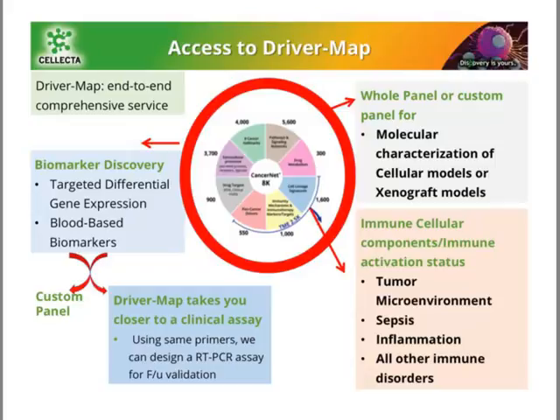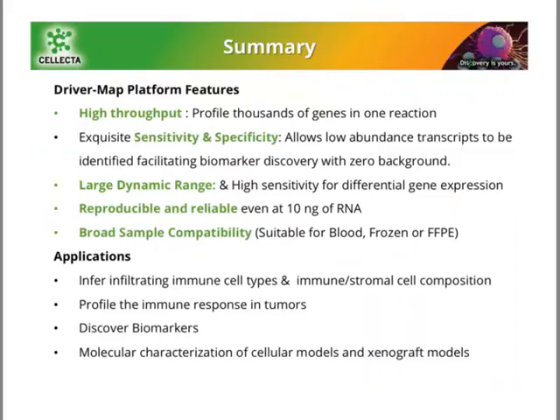This particular platform can also be used to look at molecular characterization of your cellular models or xenograft models. Or the aspect that we focused on initially, which was the tumor microenvironment. Because we're looking at immune components, it can also take us from therapeutic indications in cancer all the way to immune-related disorders. So that's another intended application.